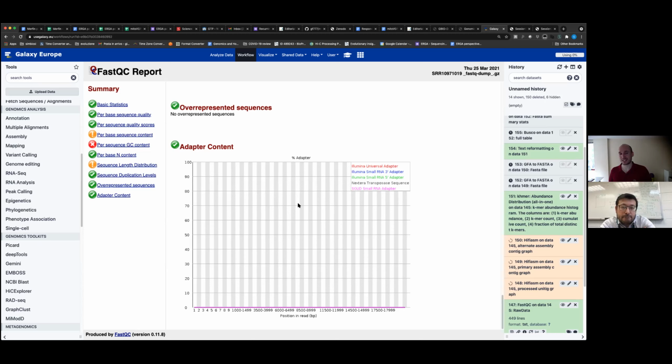There is a lot of junk in the assemblies that are submitted to the archives, so they have to pay a lot of attention. I mean, I'm not saying that people are submitting junk. I'm saying that within a submission there may be a good assembly, but there are a lot of small contaminations.